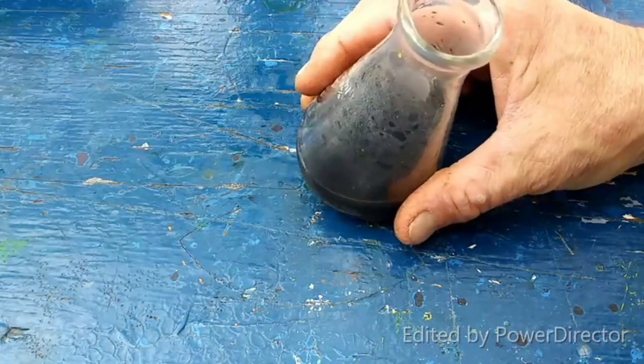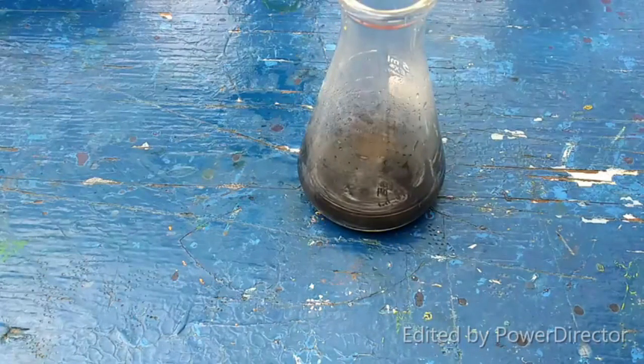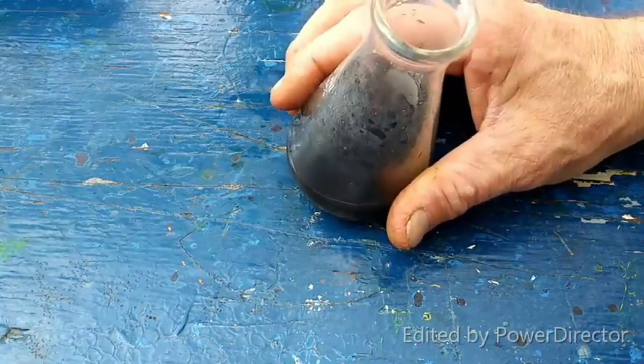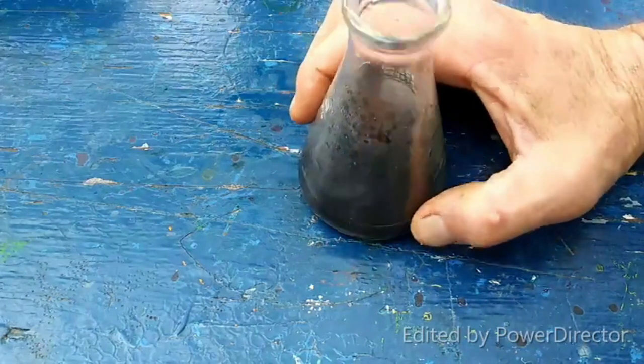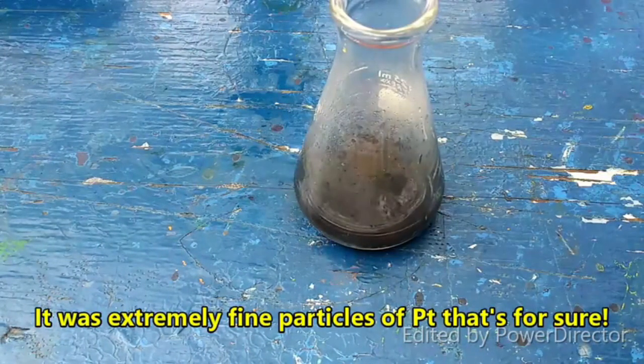So, yeah, that looks like a very, very convenient and instantaneous method for reducing platinum down to, I mean, very small particle sizes. Although it appears to clump very easily. So, I don't know. But there you go. We did, still wasn't quite the way.